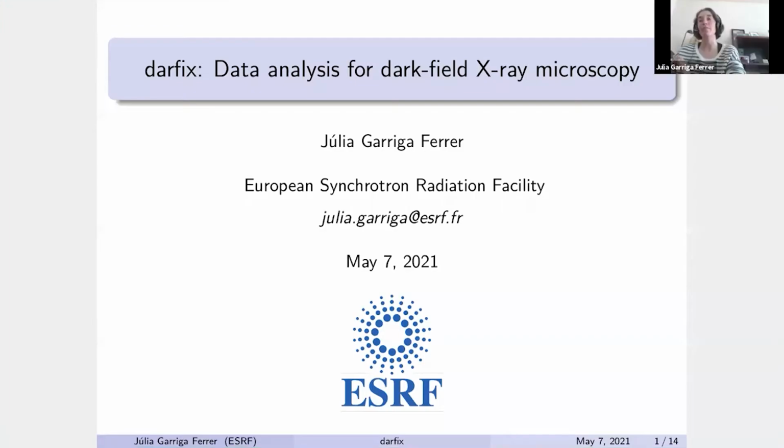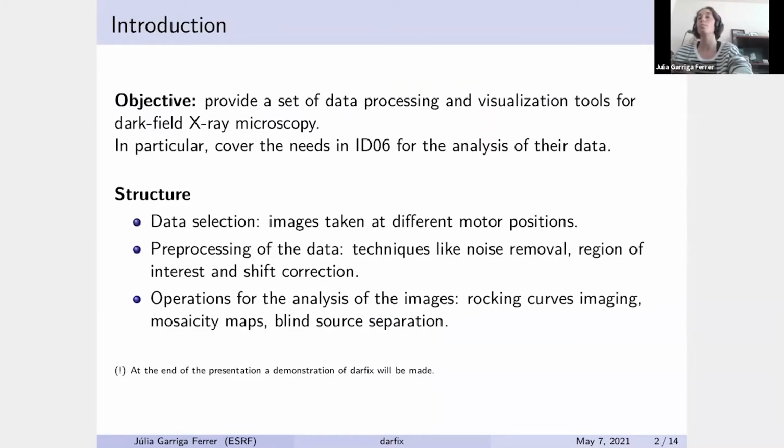a Python library, which is being developed at the data analysis unit at the ESRF together with the team of Karsten Detlefs. And it is for the analysis of dark field X-ray microscopy data. So the objective of Darfix is to provide a user-friendly package to generate maps, like the mosaicity or strain maps that you've seen from previous speakers.